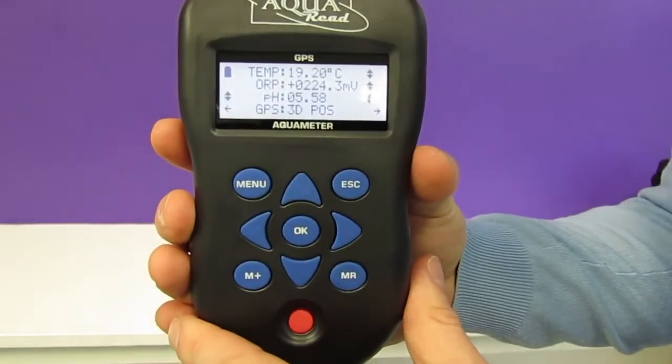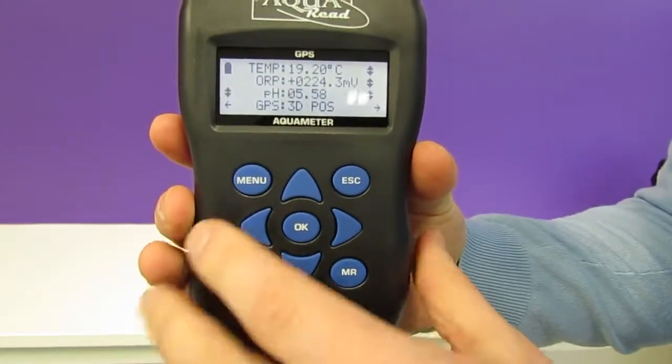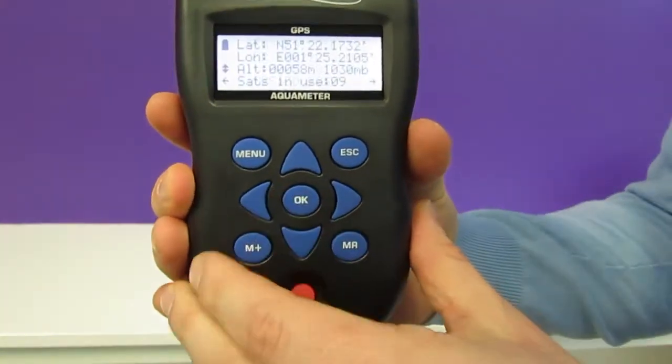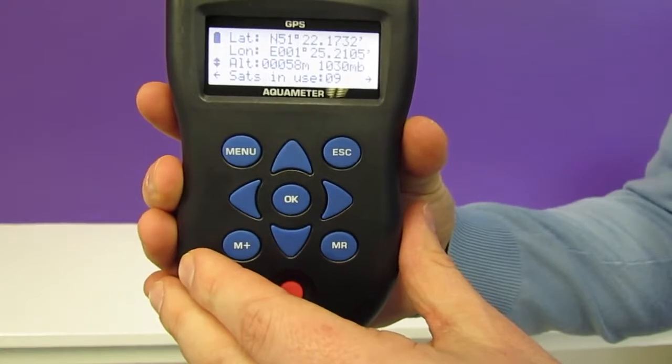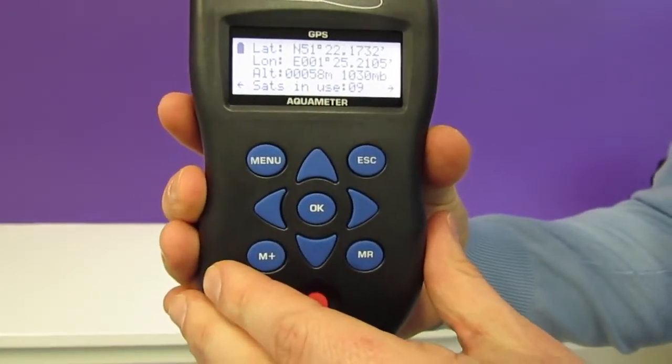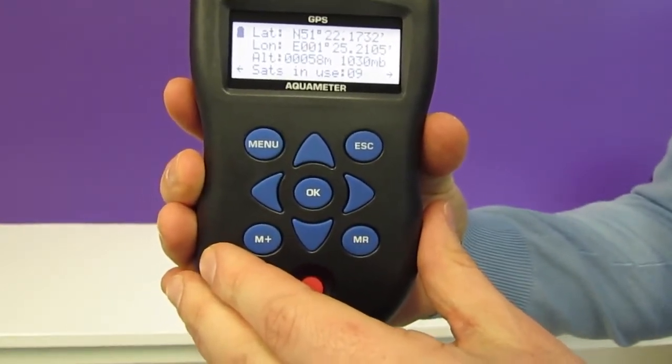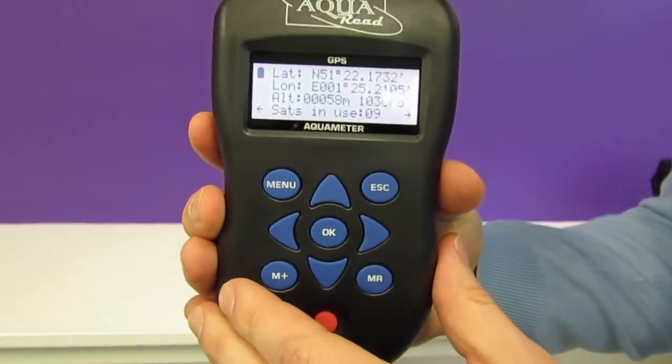We can see here on the screen that we currently have a 3D GPS position. If we scroll to the left we can see the lat long coordinates and we can also see the air pressure because the GPS Aquameter has a built-in pressure sensor. It will also give us some useful information and tell us how many satellites are currently being used.